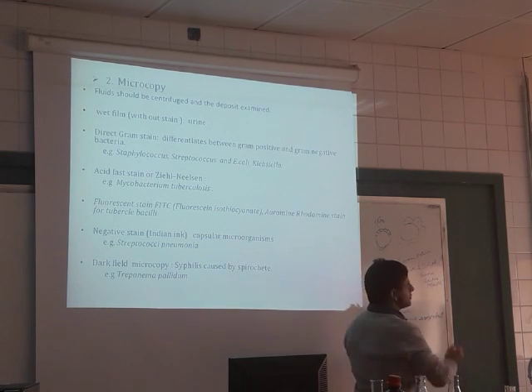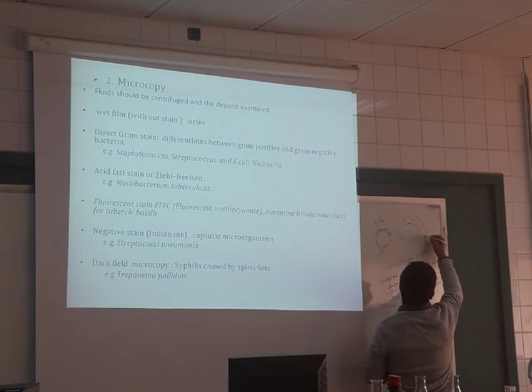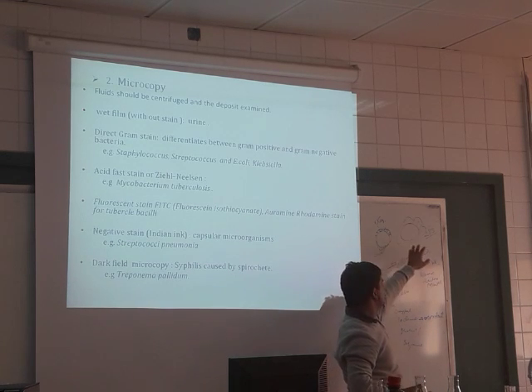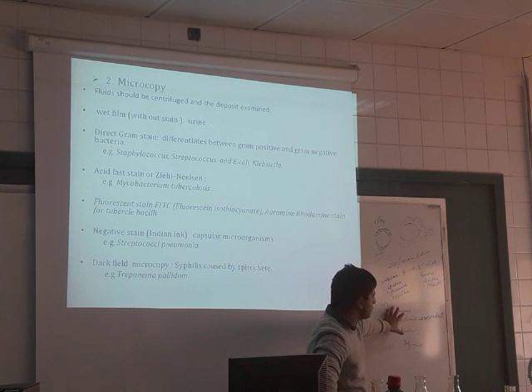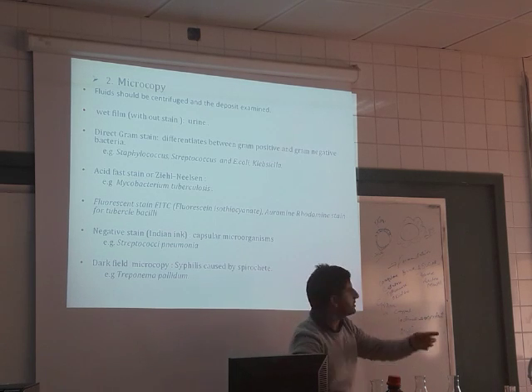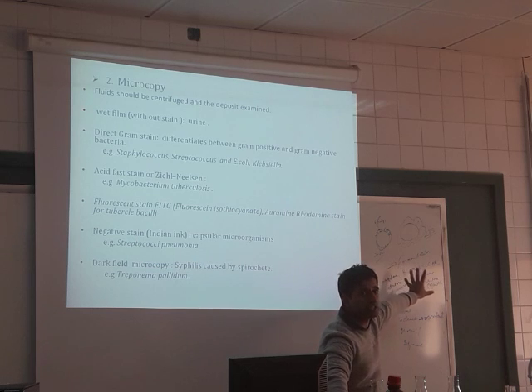And what is in the gram negative? It will be thinner. There is a lipopolysaccharide layer in the gram negative. So what happens actually when you do the gram staining? Listen to me carefully. When you add the crystal violet, it's taken up by both the cell walls.